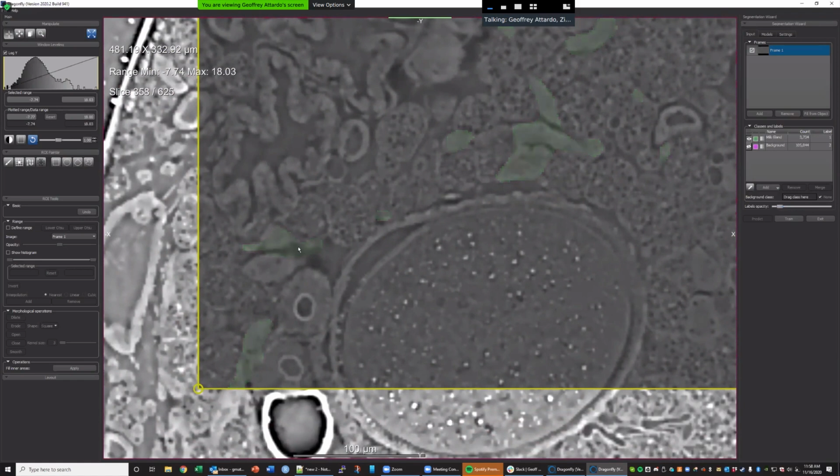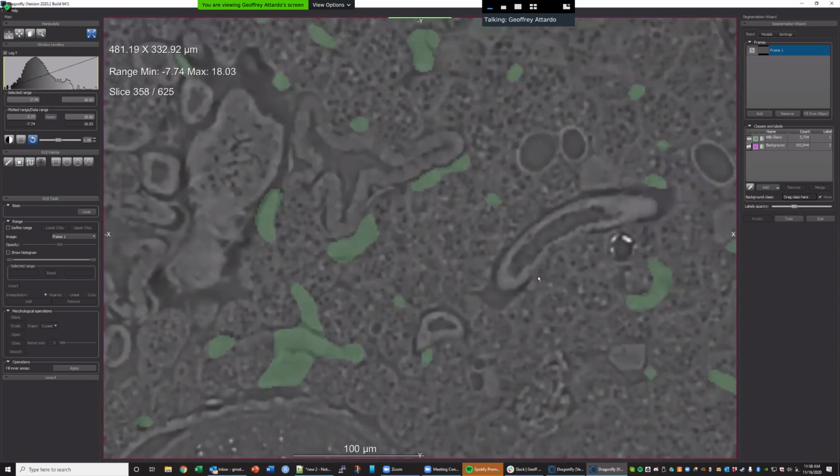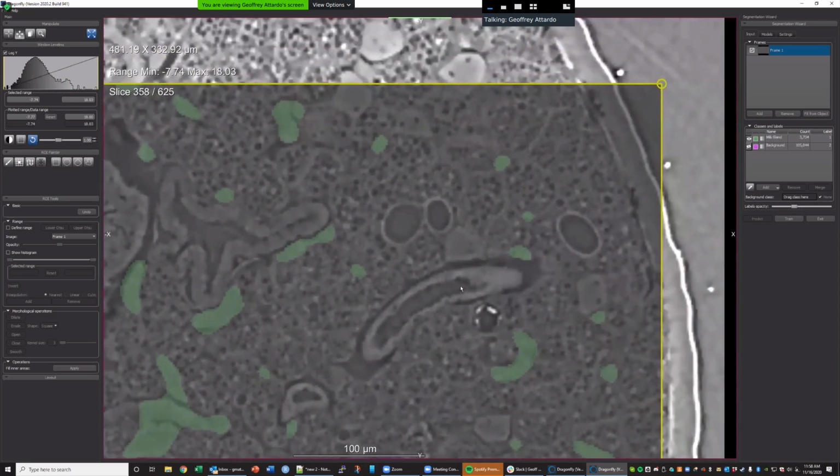Here also, you see what I mean? I think I was doing the whole thing by hand, so I got tired at some point. I understand. That's why we need the segmentation wizard. We only work with a few frames, not the whole data set. Yeah. Too much.